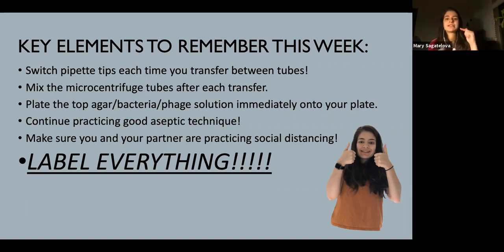Plate your top agar bacteria phage solution immediately onto your plate. And then continue practicing good aseptic technique, right? Don't be contaminating everyone's microcentrifuge tubes. We really want to see some really honed in aseptic technique this week.